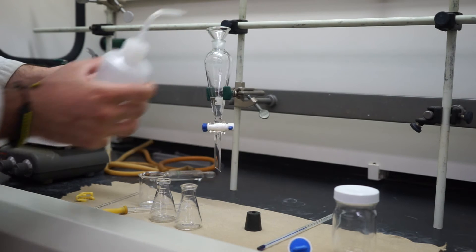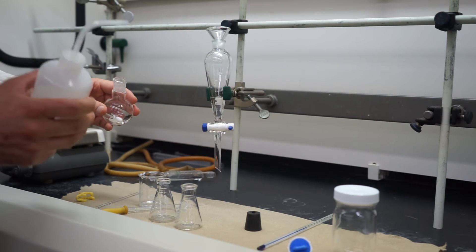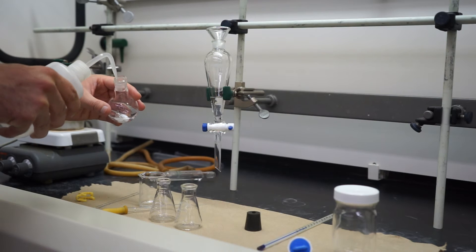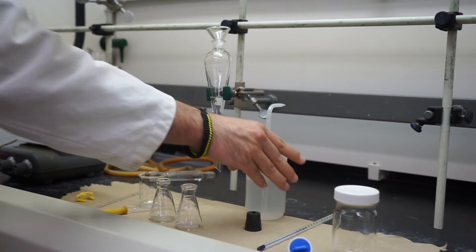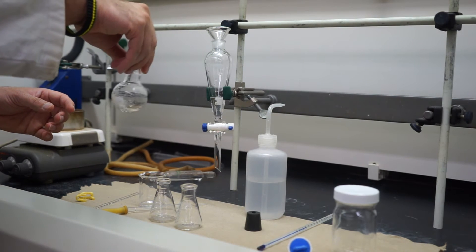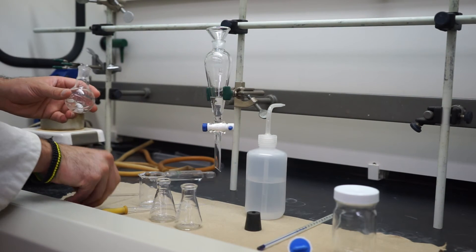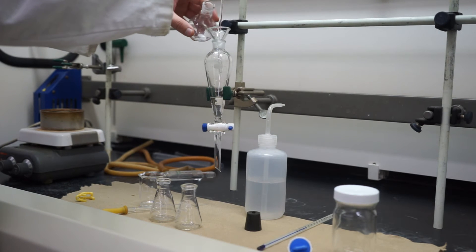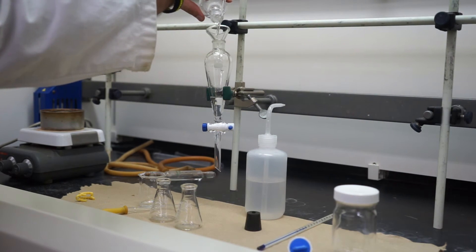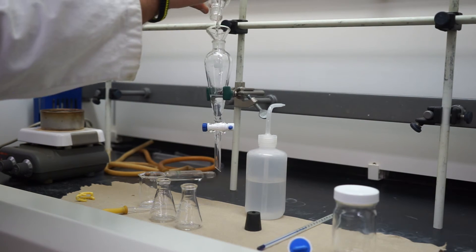Afterwards, you're also going to want to do an aqueous phase transfer. We'll get some water — again, one or two milliliters — squirt it on the inside, give it a nice little swirl and shake it up. Then we'll go ahead and transfer that over again. Pouring along the side of your stirring rod will help you avoid spilling any liquid.